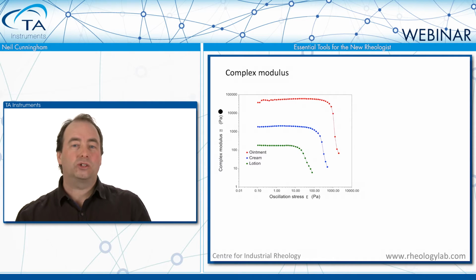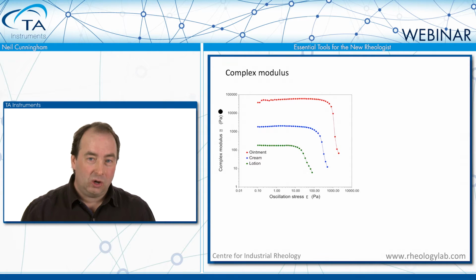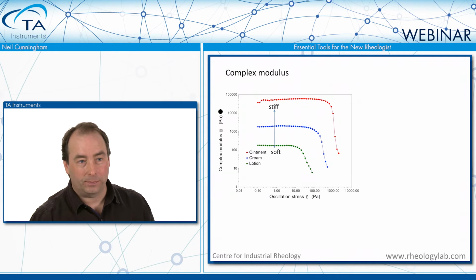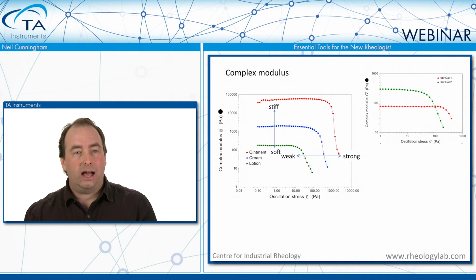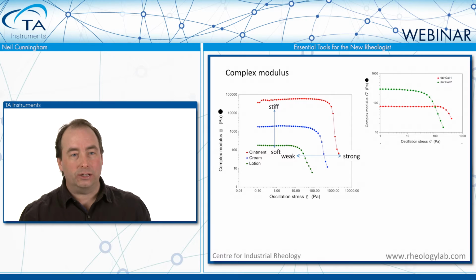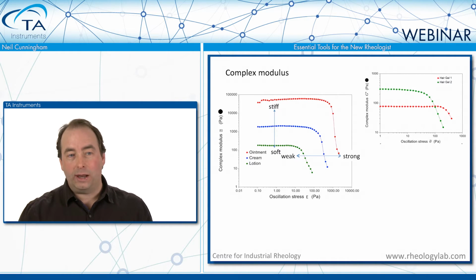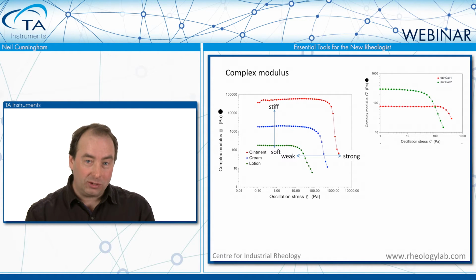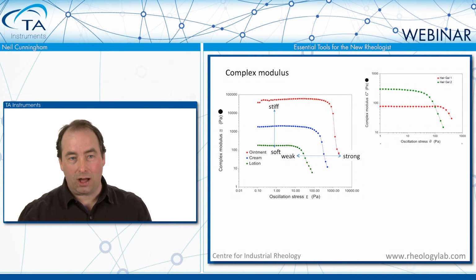One thing it's very important not to confuse is rigidity, so the complex modulus plateau, with the strength of the structure. And I've got a good example here. Okay, what we can see here is an example of two hair gels. For hair gel number one, the red curve, we're seeing a low complex modulus plateau. So it's a soft gel. It would be wobbly in the tub. You can see it bounce, okay, but it's got a high strength. It's got quite a high yield stress.